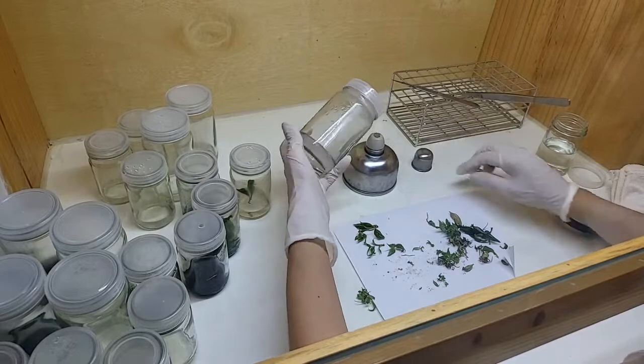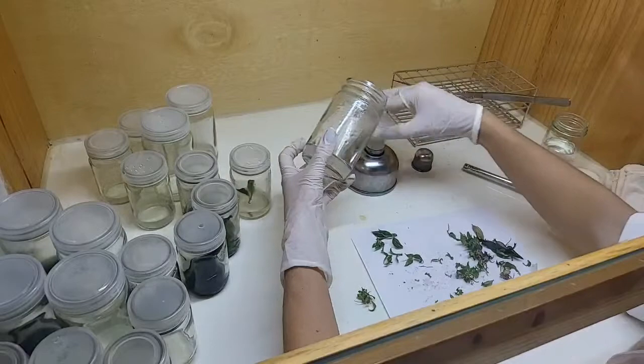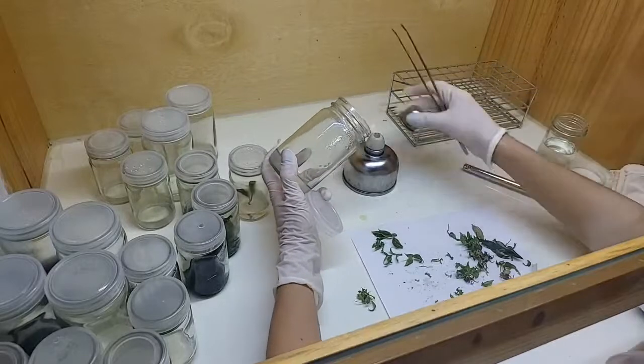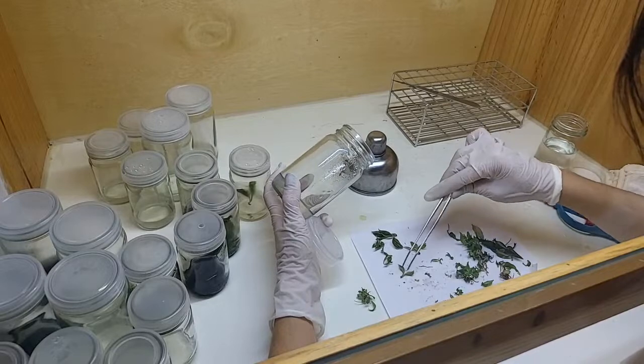We normally use two sizes of bottles: the 8-ounce and the 4-ounce. For the 8-ounce bottle like this one, we're going to put a couple of plants in. For the 4-ounce, we're going to put fewer.